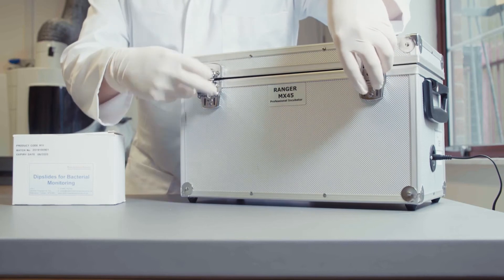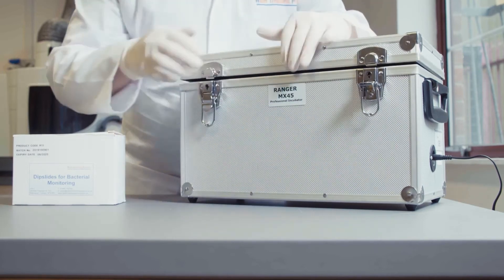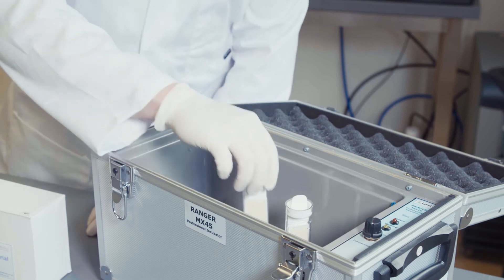Dip slides are ready to incubate. Turn the incubator on and check temperature setting. Most are preset or cannot be changed.